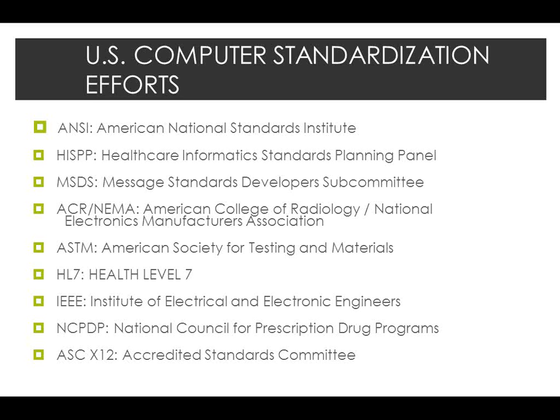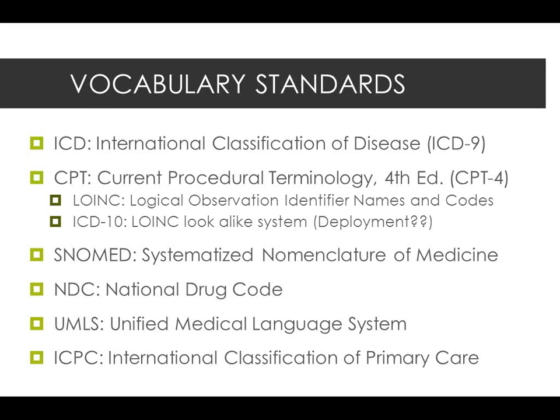Computer standardization efforts, these are all the groups that are involved, and I won't go through all these. The one that's most important is the one you already mentioned, which is HL7, or Health Level 7, and that's the one that for all medical devices, instrumentation, radiology, scanners, LISs, EHRs, all of those are HL7 compliant. Okay. So vocabulary standards, and we were talking about this a little bit earlier.